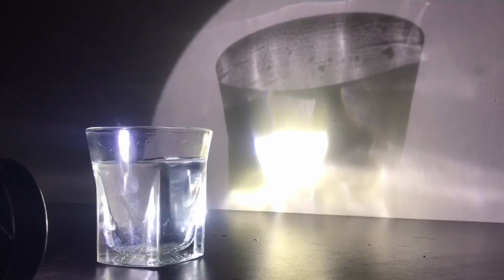As we see, in a true solution, the flashlight beam should not scatter. As you can see, the light goes straight through. The salt particles are too small to scatter the light, so we don't see a visible beam. There is no Tyndall effect.